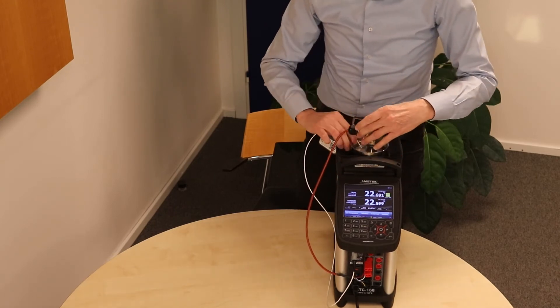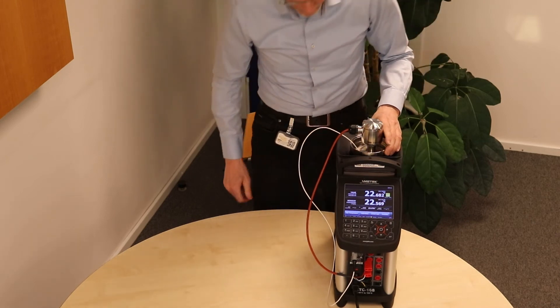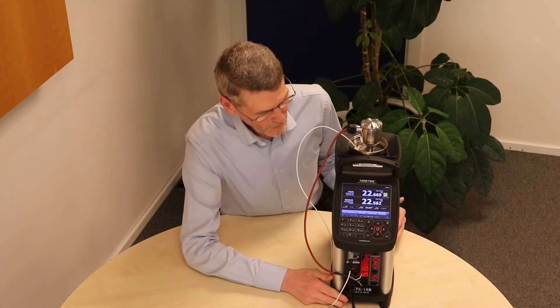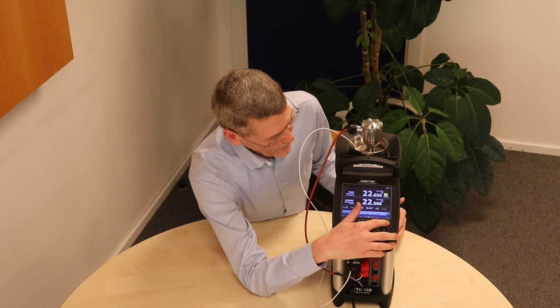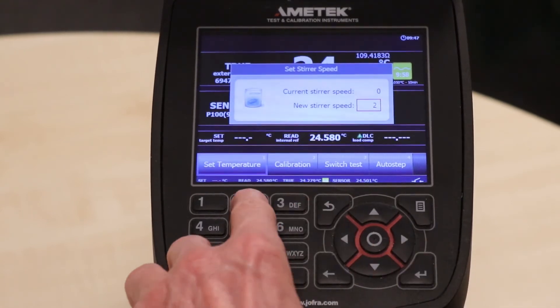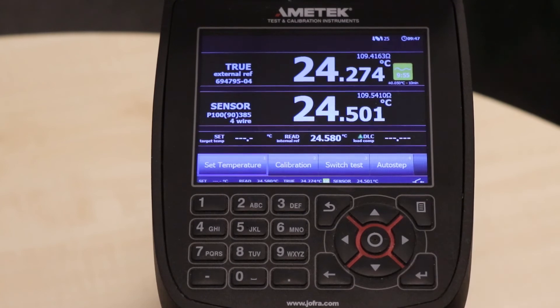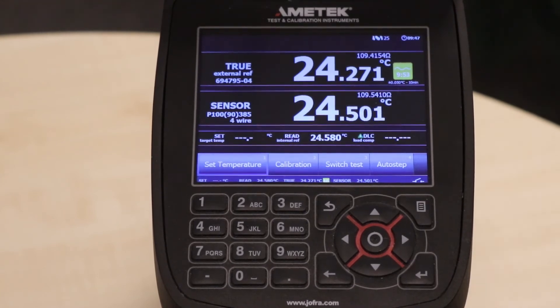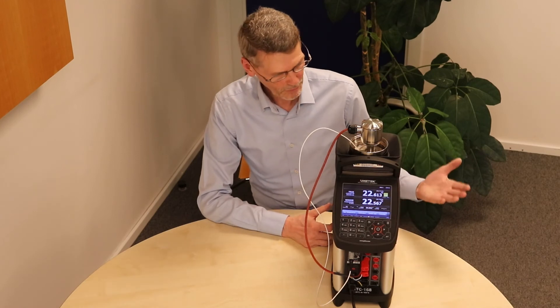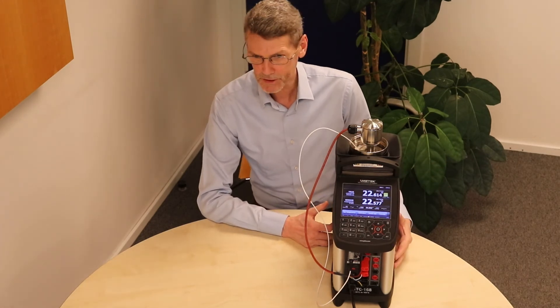We take everything and put it into the calibrator. Now we are ready. We set the steerer speed as well — go into the menu, go to the steerer menu, and set the steerer speed to 25, then enter. You can hear the steerer is running. The system is ready and we just need to set a temperature.